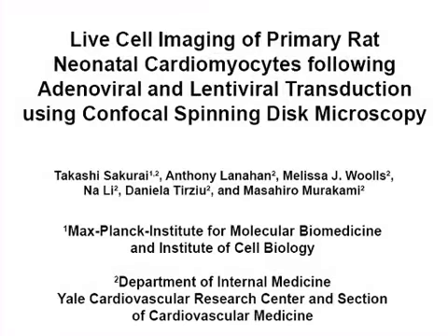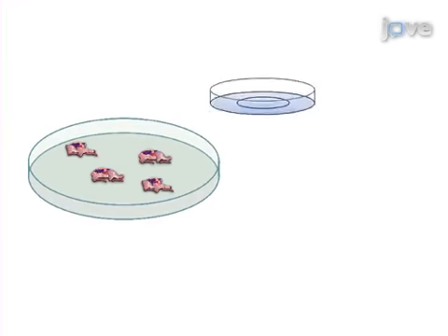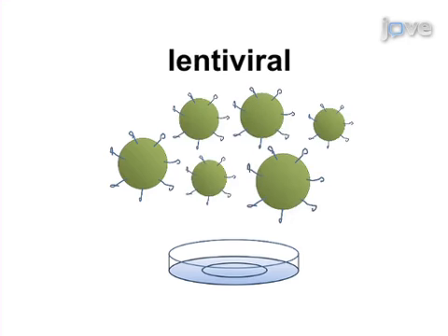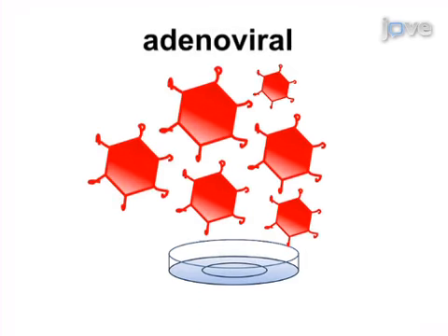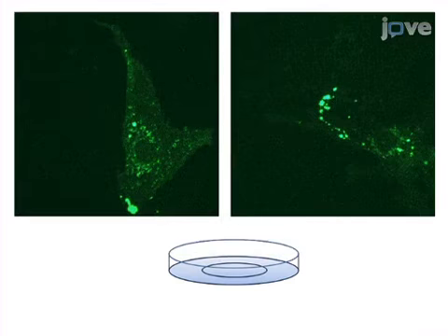The overall goal of this procedure is to acquire time-lapse images of primary rat neonatal cardiomyocytes following lentiviral and adenoviral transduction using confocal spinning disc microscopy. This is accomplished by first harvesting cardiomyocytes from rat pups and plating the cells on glass bottom dishes. The next step is to perform transduction of EGFP-tagged connexin 43 by lentivirus, followed by transduction of dominant negative FGFR1 by adenovirus in the cardiomyocytes.